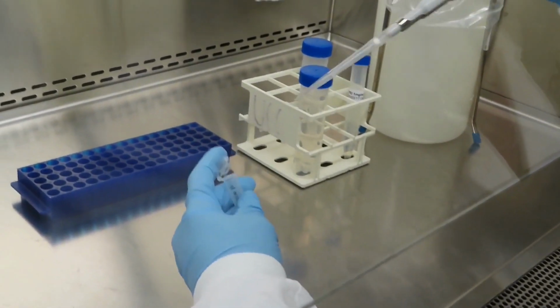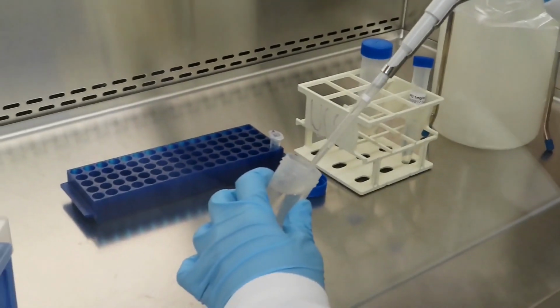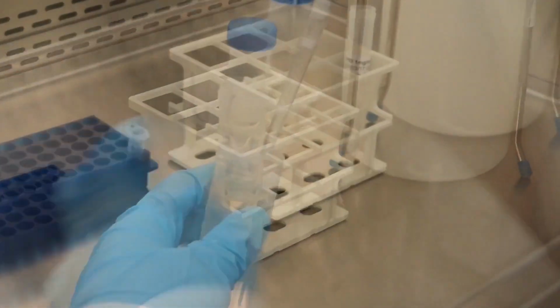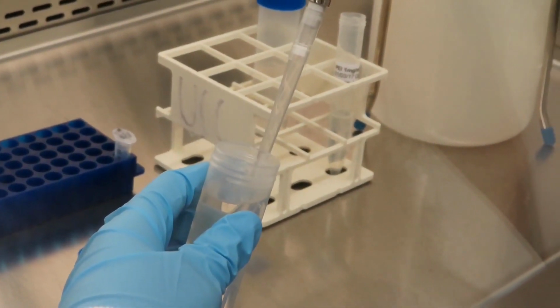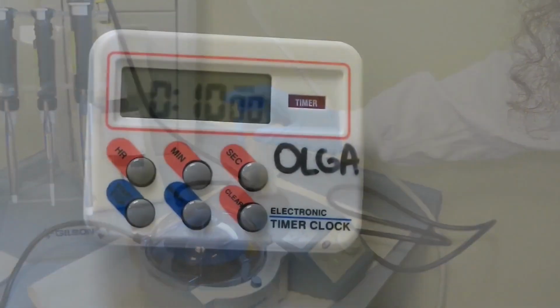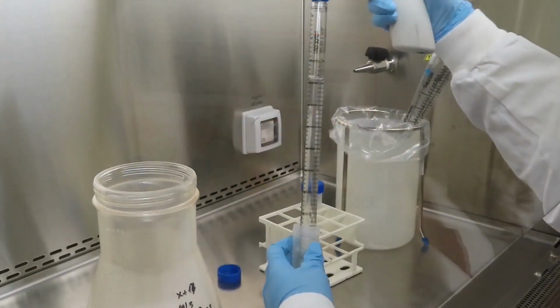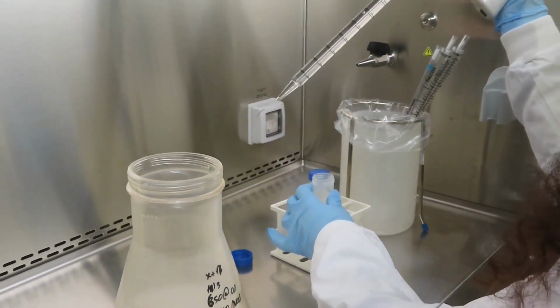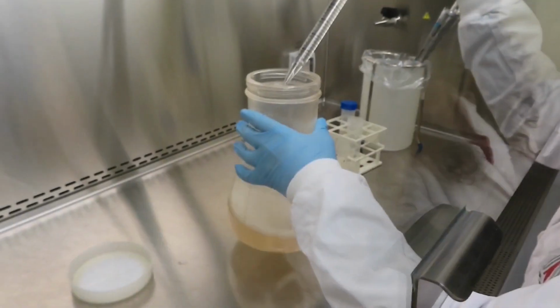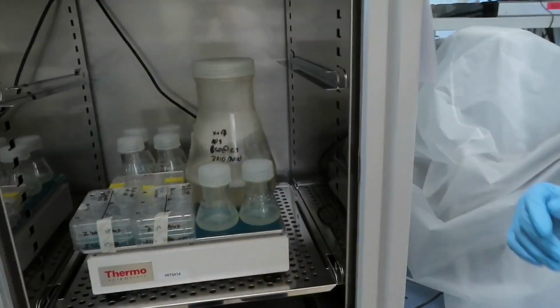In a tube with 50 milliliters of culture medium, the plasmid is added at a ratio between 0.5 and 1 micrograms of DNA per milliliter of cells. Later, the transfection agent is added in a proportion of 3 milligrams of PEI per milligram of DNA. The mixture is vigorously mixed and then kept resting for 10 minutes at room temperature to allow DNA-PEI complexes to form. After the 10 minutes, the mixture is added slowly to the cell culture and under agitation in order to distribute it homogeneously, avoiding in this way high local PEI concentrations that are toxic for the cells.